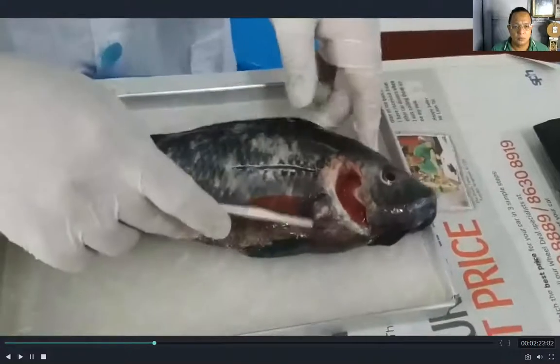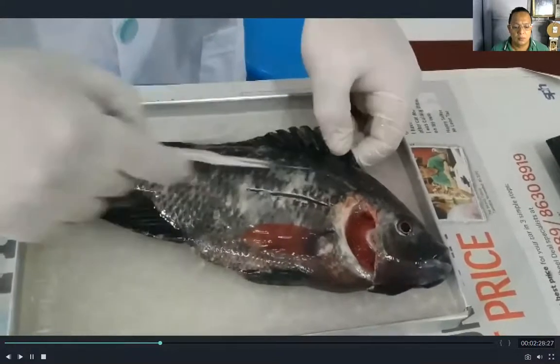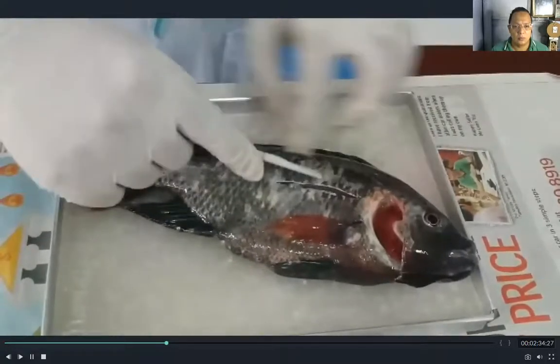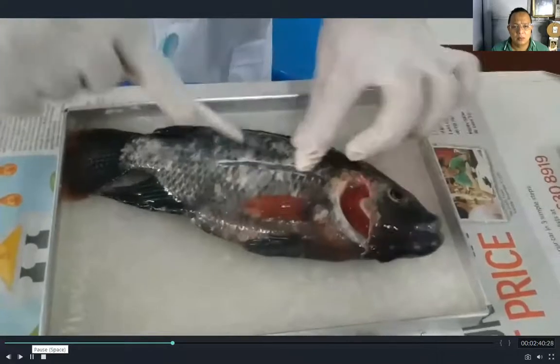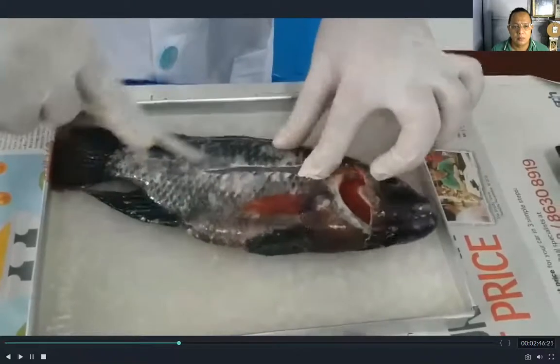This is the lateral line. That one is very sensitive and serves as a sensory organ. It is made up of sensory cells. The lateral line of the fish serves as the sensory organ and is very sensitive to pressure, vibration, and the movement of the water. This helps the fish find food or locate its prey.